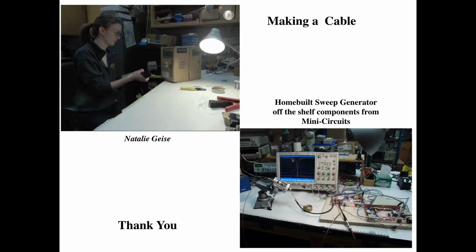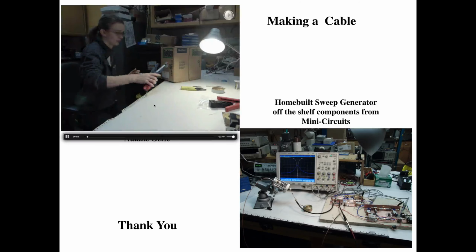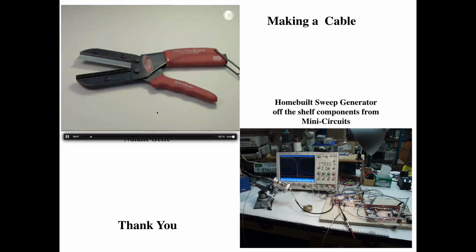Okay, finally, if you've never made a coaxial cable, here's a little movie. Natalie Geis is going to make a cable for us. Here she is cutting off some coaxial line. Okay, get a good pair of cutters. They're indispensable.